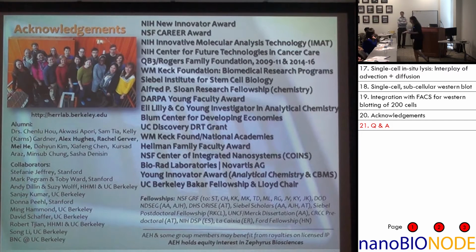Now, it's a tricky issue, and maybe this is why you're raising this. GAPDH, for example, is a housekeeping protein that's been very widely accepted to normalize signal. Well, it turns out that GAPDH seems to have a lot of heterogeneity in cancer. So if you're using that marker, you're confounding two signals. So we've chosen to use several housekeeping proteins, not just one. We also do imaging beforehand so we can get an estimate of the size of the cell, which can also help us normalize to cell volume as well. But I would argue that it is not a clear-cut answer with proteins in particular. Yeah, it's a great question.